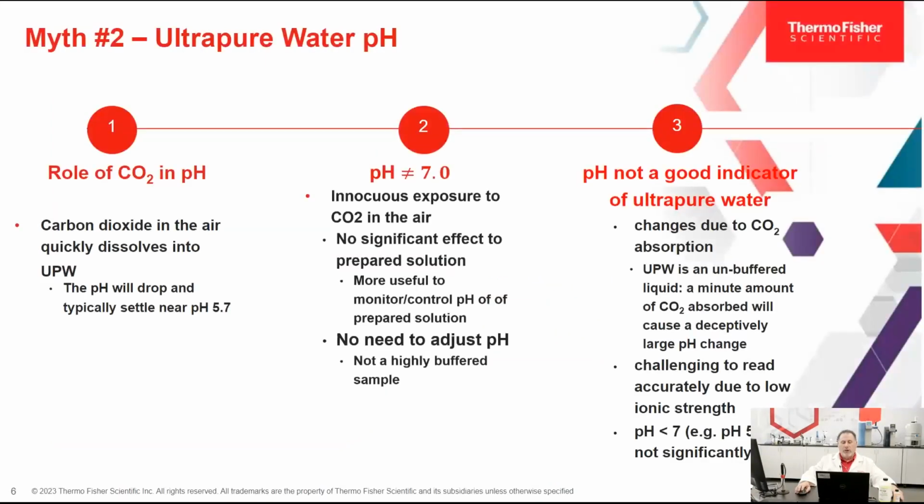So what's going on with our pH readings? Again, we are seeing the effect of carbon dioxide dissolving into the water. We talked earlier about bicarbonate ions and hydrogen ions affecting the conductivity, so it also happens with pH. It happens very quickly.